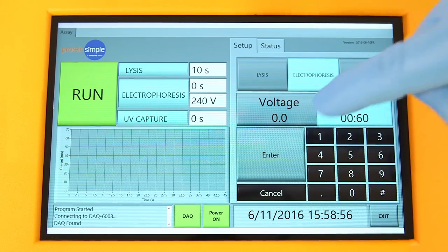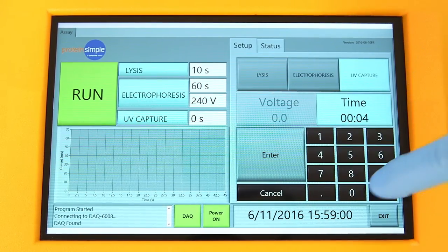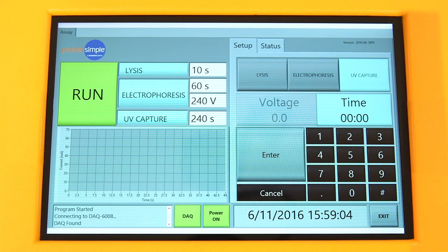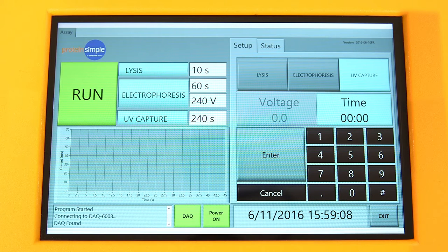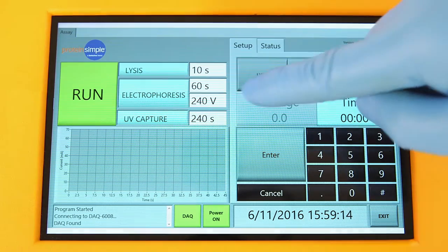When starting a new assay, we recommend a 10-second lysis time, a 60-second electrophoresis time, and a 4-minute UV capture time. The lysis and electrophoresis times can then be adjusted depending on your particular protein targets. The electrophoresis voltage should always be 240 volts.